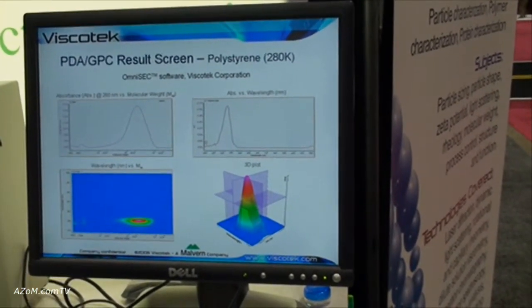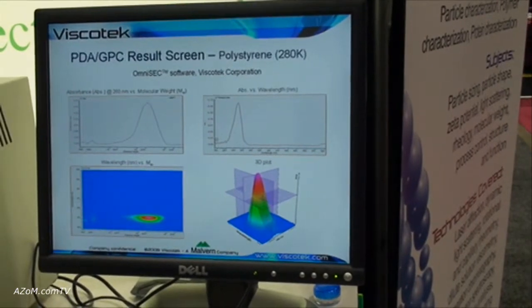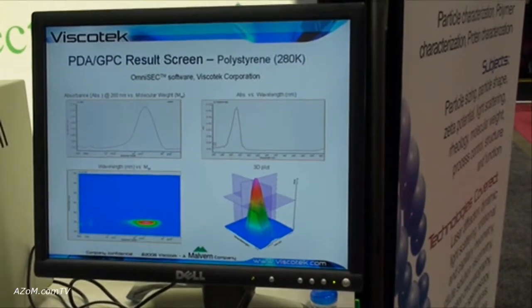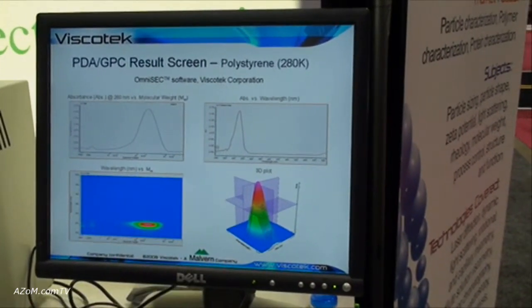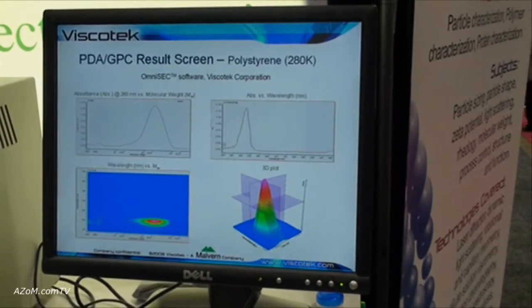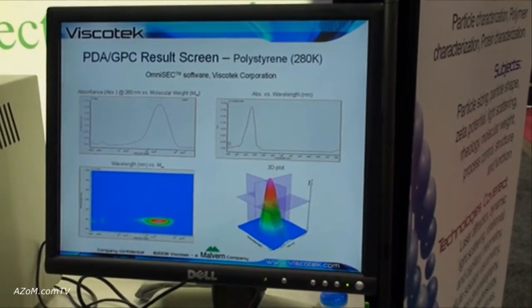You get nice contour plots where you can see how absorption changes across the distribution, as well as 3D models that you can use for publication images.